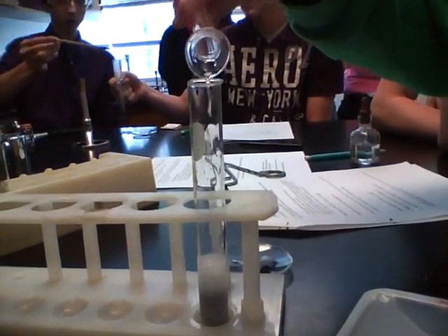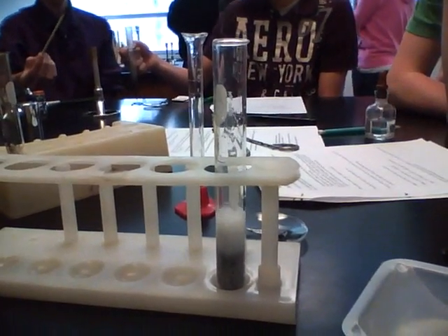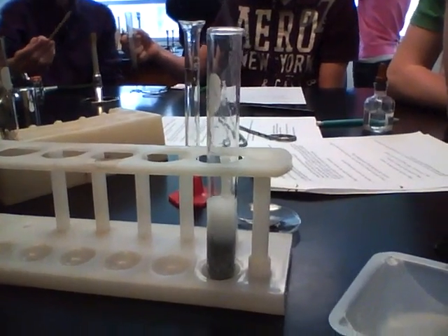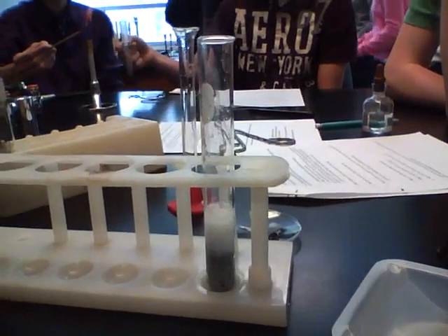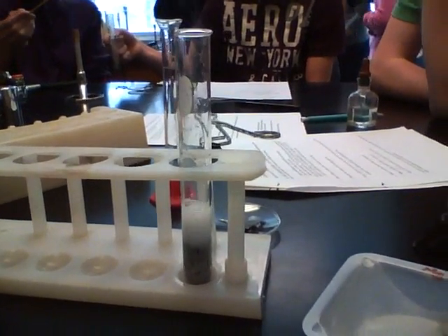The next reaction we're going to look at is a single replacement reaction. The metal that started in the test tube was zinc, and then the clear liquid that was added to it was a pretty concentrated hydrochloric acid solution, HCl.